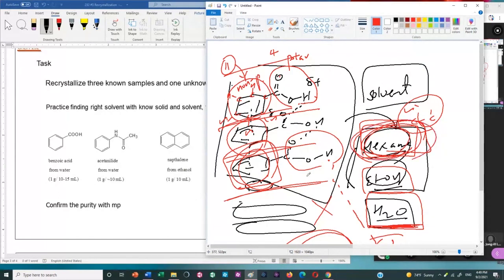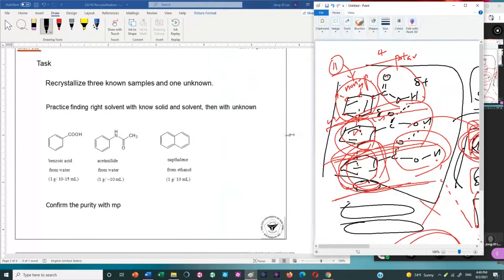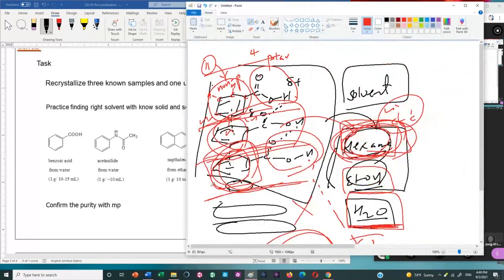If you still have hexane, as it melts, it interacts with the hexane in the same manner we discussed, so it dissolves well. It dissolved anyway without heat, but the heat loosens up the solid, so you dissolve the solid better with heating. Same for ethanol.